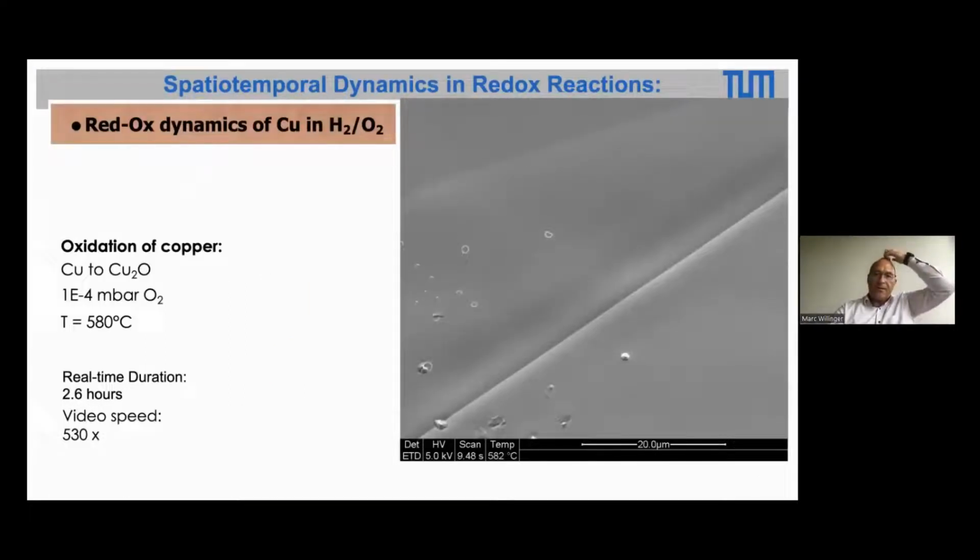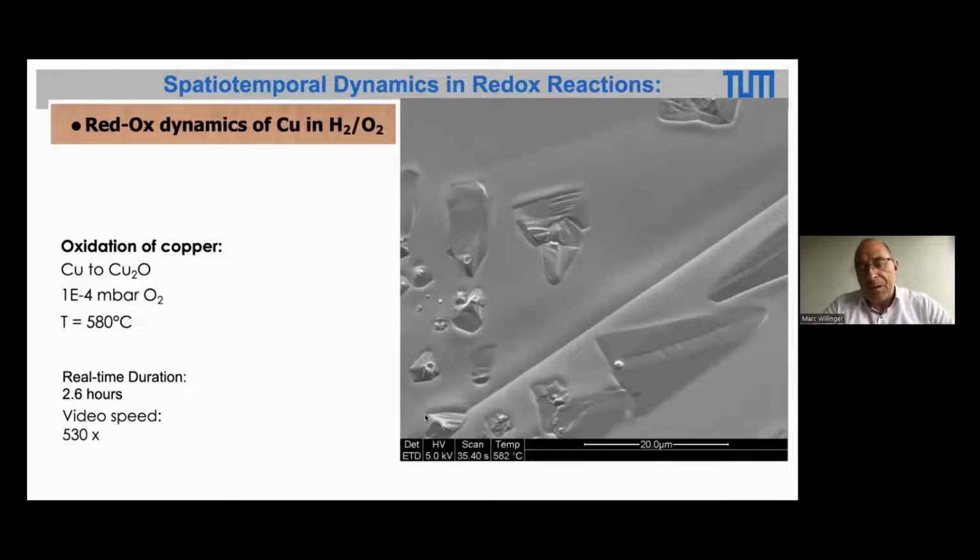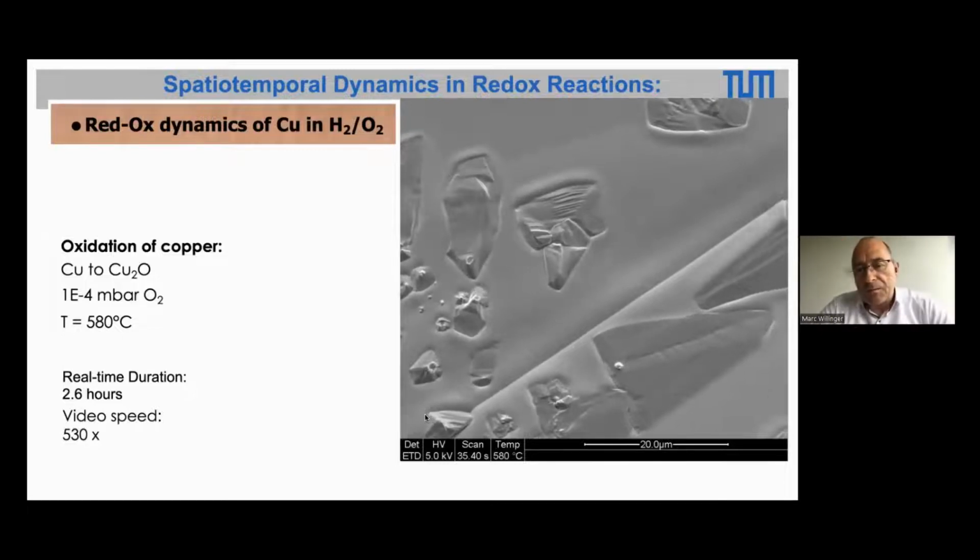And the next thing that we started is oxidation processes. And I'm just showing here, not like for the fuel cell, but in this case, simple metals, in this case copper. We studied the corrosion behavior of copper. And the interest, of course, was not only to study the corrosion behavior, but we wanted to study the redox behavior and finally catalysis. I just show you this video to impress you a bit by the beauty of being able to follow oxidation processes.